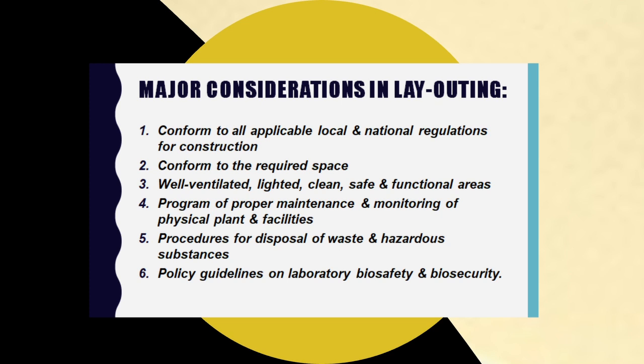There shall be well-ventilated, lighted, clean, safe, and functional areas based on services provided. There shall be a program of proper maintenance and monitoring of physical plant and facilities. There shall be procedures for proper disposal of waste and hazardous substances. And the last, there shall be policy guidelines on laboratory biosafety and biosecurity.